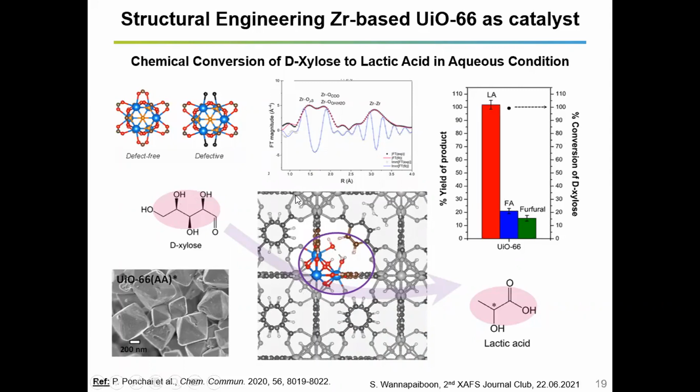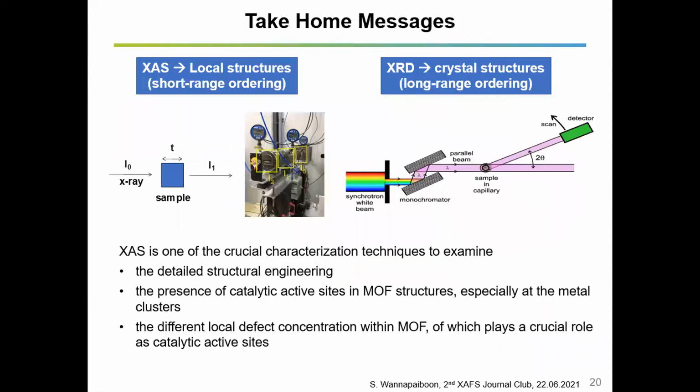So I hope that the idea of what we presented today gives you information about the way we can combine short-range ordering characterization techniques like XAS together with X-ray diffraction techniques for long-range ordering, in order to get specific information about the structure of MOFs.